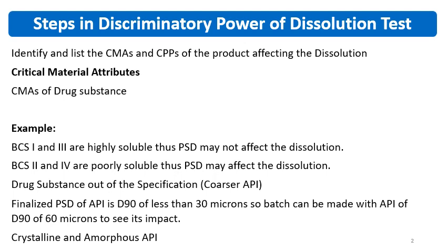In other words, if the formulator gets the similar dissolution of the test formulation with the reference product, then the research work stops, and then the bioequivalence is required to be tested.